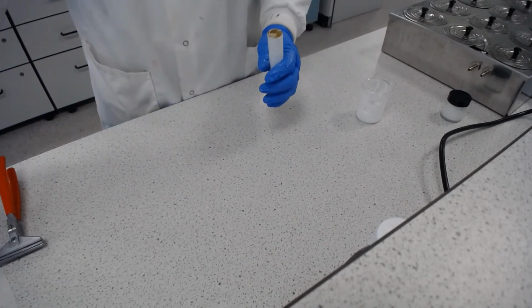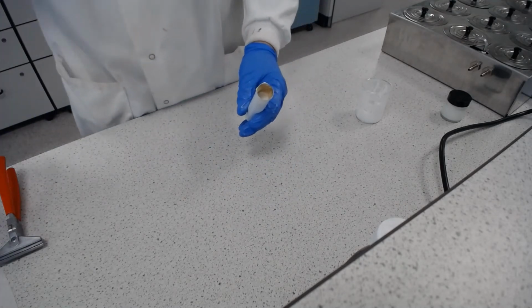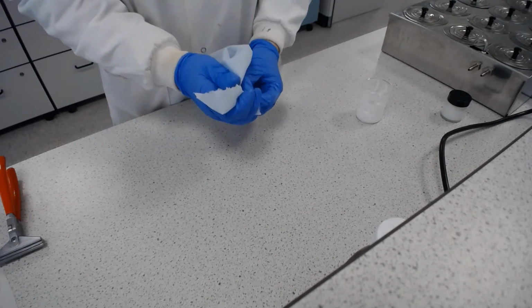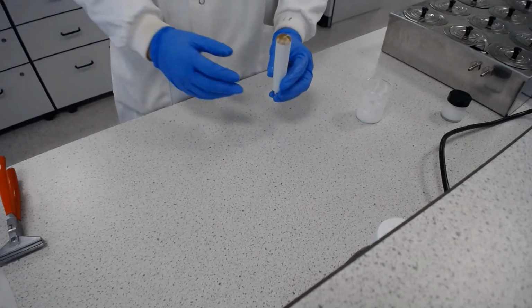But we have that filled now, so you've got the squeezing out through the greaseproof paper method, and we've also got the way where you can just use the palette knife to scoop it in the back. Obviously, industrially, you would just have some sort of nozzle that would fire it in there. And then we also need to seal the end.